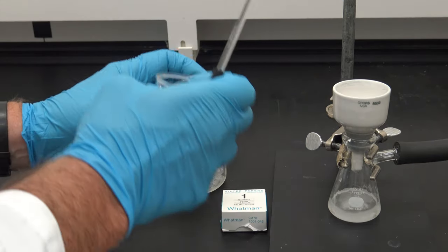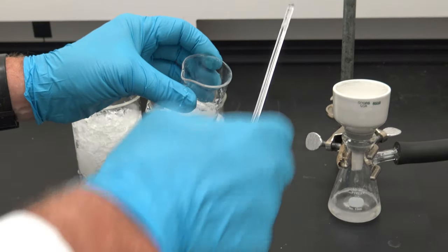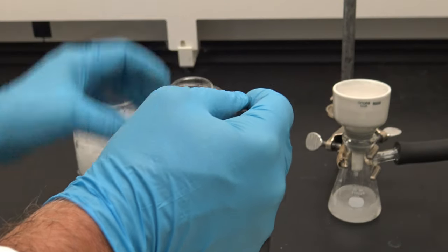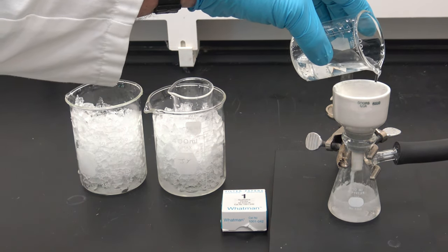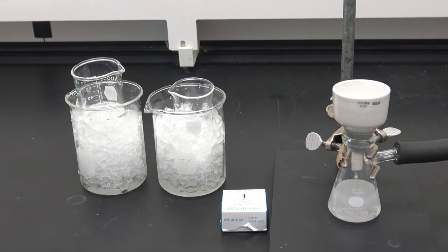I'm going to rinse out my beaker with a little bit of water. That will be ice water, and pour it down through there. I'm also going to now wash my salicylic acid with just a little bit more of chilled DI water to rinse any ions out of it. And then I'm going to leave it on the vacuum for approximately 5 minutes to help dry it.